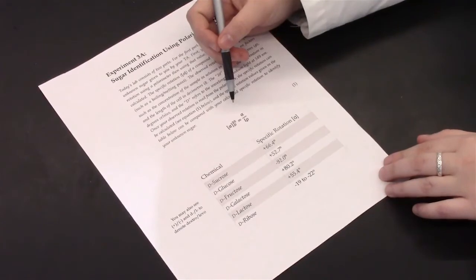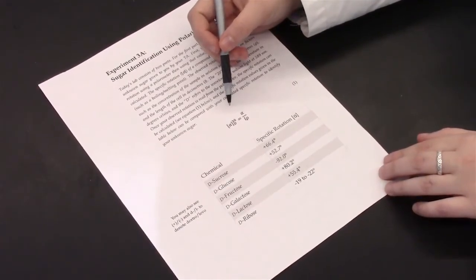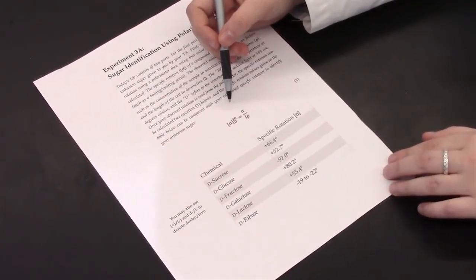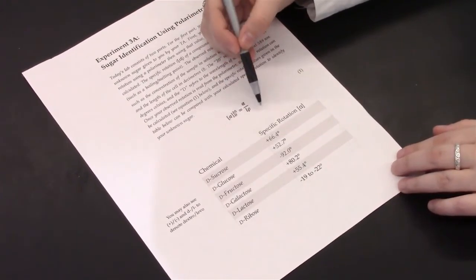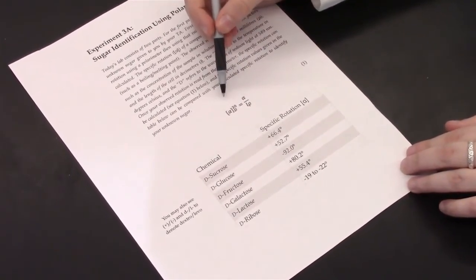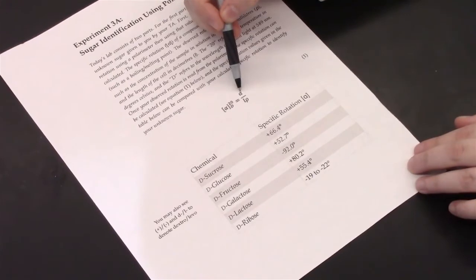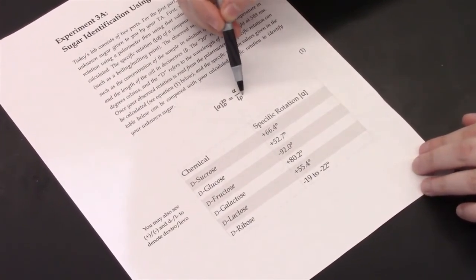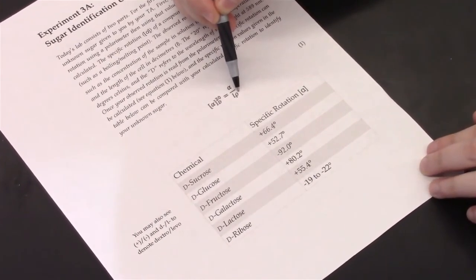When you find your observed optical rotation value, you are able to solve for the specific rotation using equation 1. Divide this observed optical rotation value by the concentration of your solution and the length of the tube.